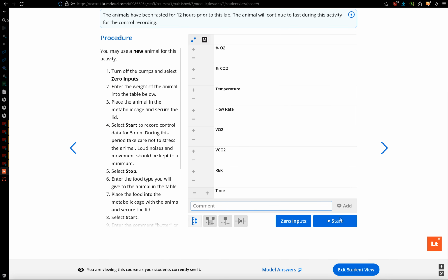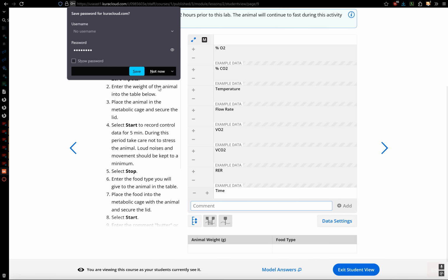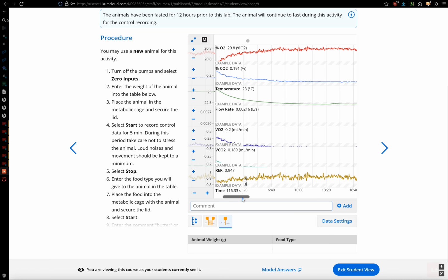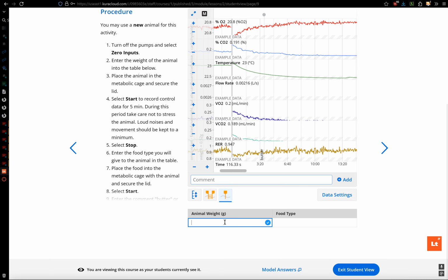And then you're performing the same idea here, where you type in BIOL 3510, and you can see which experiments we're performing on. So this one has its own insect weight of 0.52 grams, and it was fed butter.